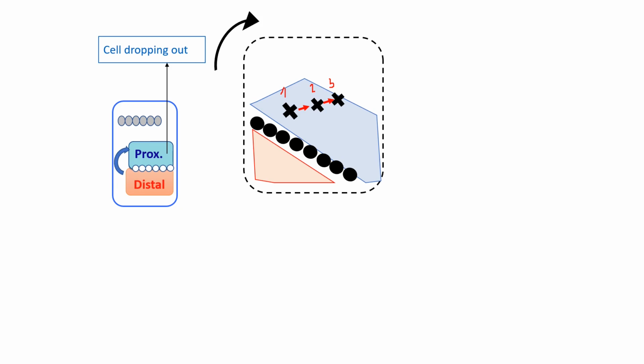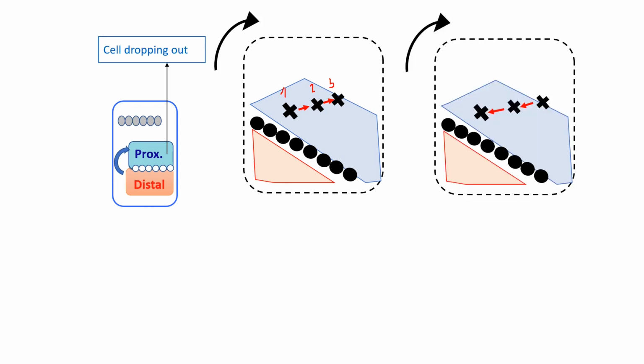As the sex comb rotates, the cells start dying one, then the other cell, and then the other cell as the rotation proceeds. Another option could be the opposite. As I said before, maybe this cell died first, then maybe this one dies second, and this could be the third one. So instead of going in this direction, it could go in the opposite direction.